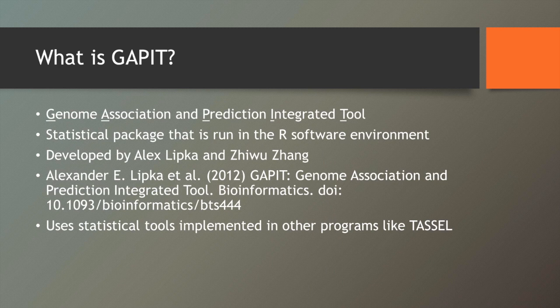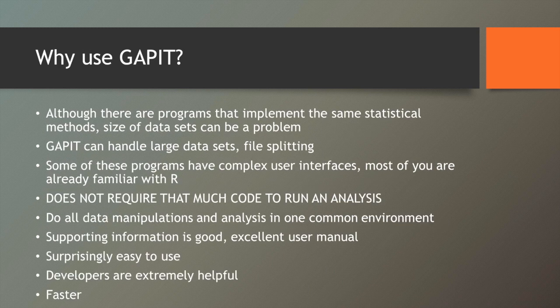There are already a bunch of programs out there that do GWAS, but one of the things that's becoming an issue as the genomic era progresses is the size of data sets, and they are getting quite large. Even my dataset — probably only about 15 million cells for the genotype data — I've already seen performance problems. GAPIT has a unique ability because it's in R.